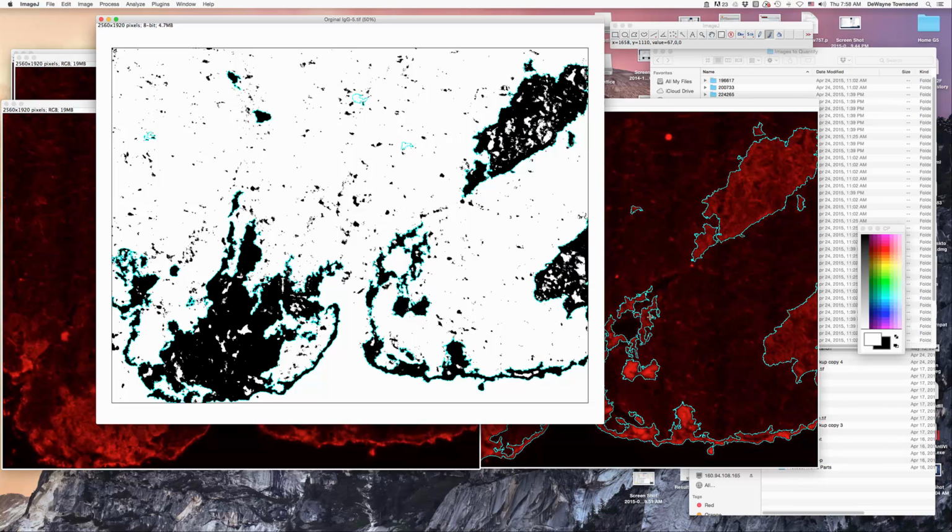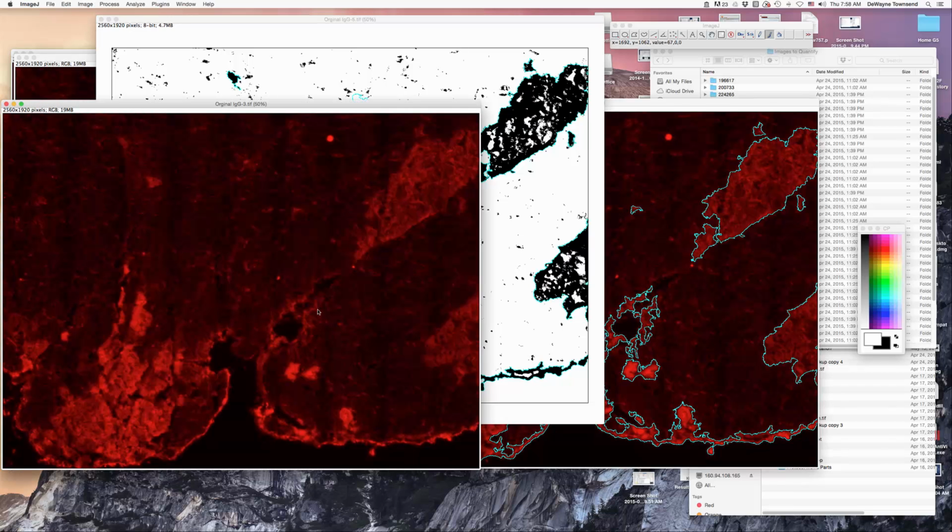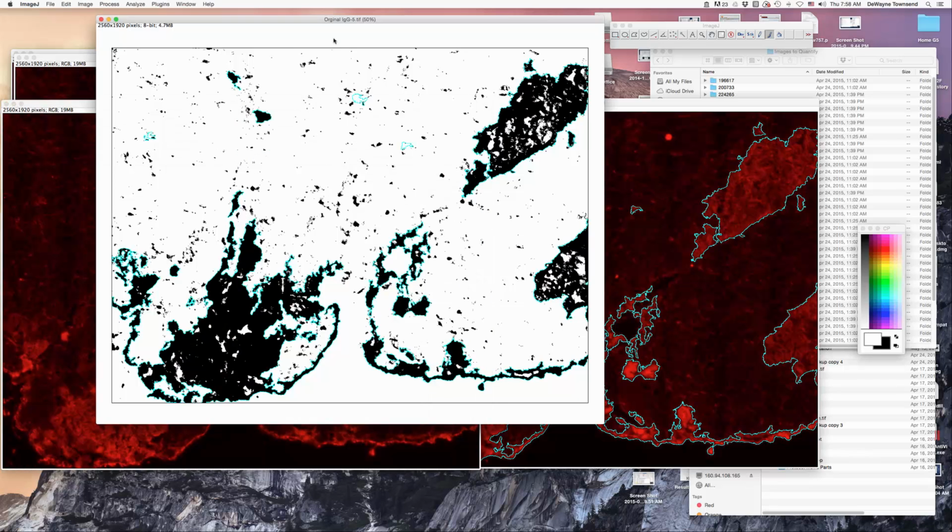And this area up here, if we look at this image, there are no positive myocytes in that area, so we can likely get rid of those too. So what we're going to do is go to our image here, and I'm going to increase the size of my brush. I'm going to make it 50 or so, so that I can more effectively remove these areas without taking forever to do it.